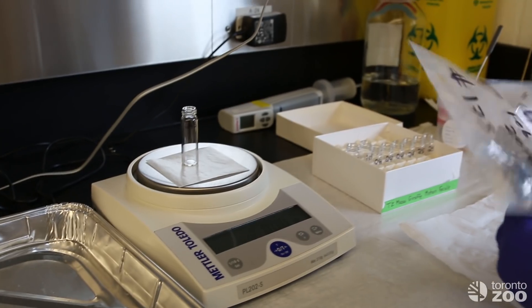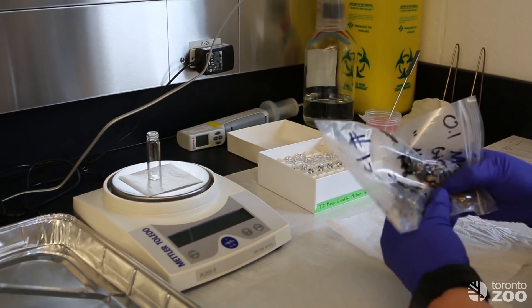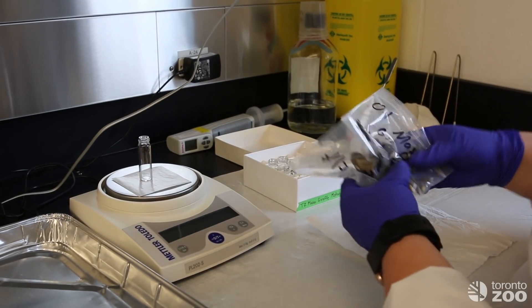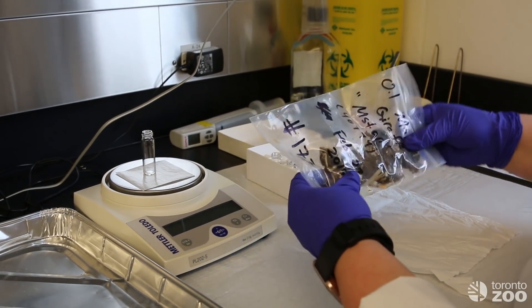We want to make sure that we mix up the sample so that it is not biased where we are getting the sample from.